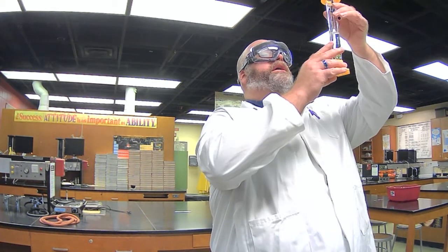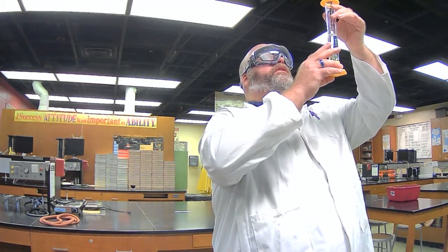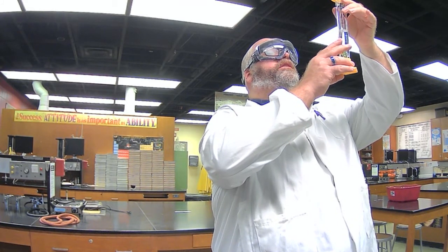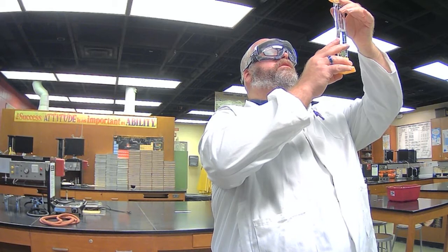And now our new volume is 55.1 milliliters. So that's the mass and the 2 volumes you need to determine the density of glass marbles. Okay, so I will then get ready to start the next one.